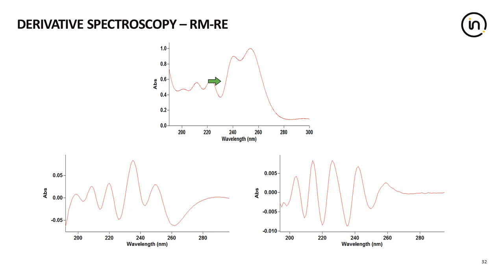So this is a very powerful technique because it can be applied to simple spectra containing unresolved bands, and especially in the second derivative spectrum, it picks out the unresolved bands very clearly. So it is very useful when there is interference from substances other than the analyte present, say multi-component mixtures.